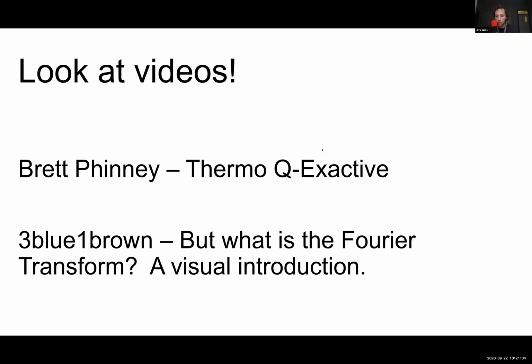And there are some really nice videos that I recommend you go and see. If I was giving this talk in the lab, I would show people these videos for sure. The first one is a Thermo Q Exactive video, which is from the vendor of the instrument, and it shows the journey of the ions through the instrument for various types of mass spec experiment. It gives you a really nice feel of exactly what's happening in there.